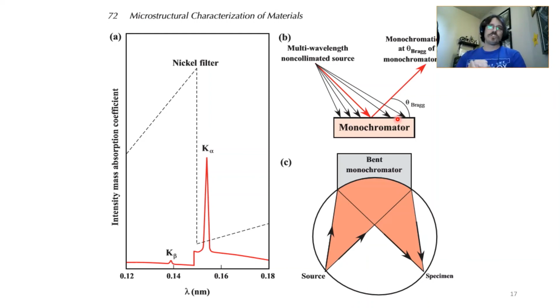So in the next lecture, we're going to talk about Bragg's law and diffraction very much. These first two lectures were talking about X-rays, specifically aspects of X-rays that pertain to X-ray diffractometry, which you need to understand to know what's going on with X-ray diffractometry.